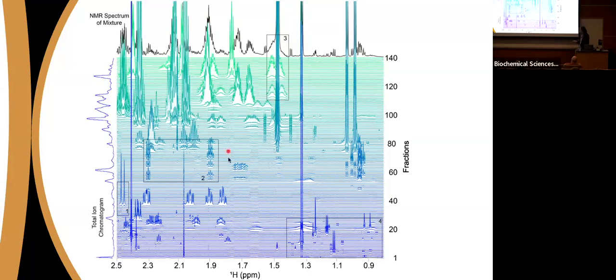And then the fourth box down here at the bottom is basically highlighting a bunch of tiny little peaks. And if you look up here, you can kind of squint your eyes and maybe see that those peaks are up there, maybe not. I'll tell you why they probably actually aren't up in the upper one, but they are in the bottom one. But we can see some very small peaks down in this fraction library, and those are real, and they can be correlated, and they've been made into basis functions as well.